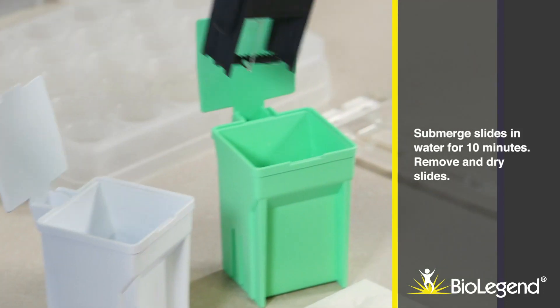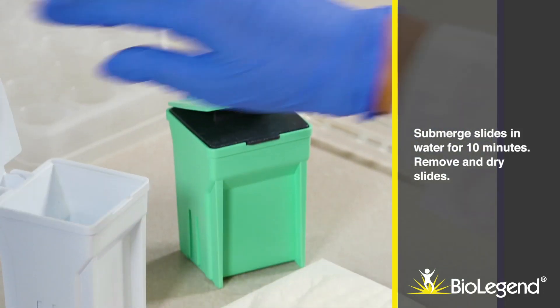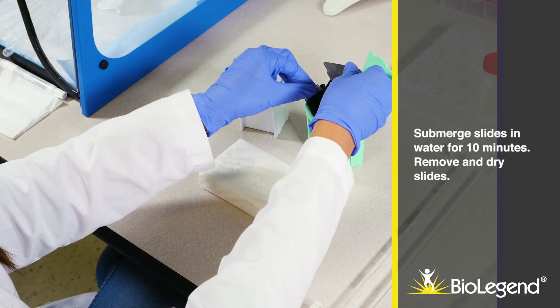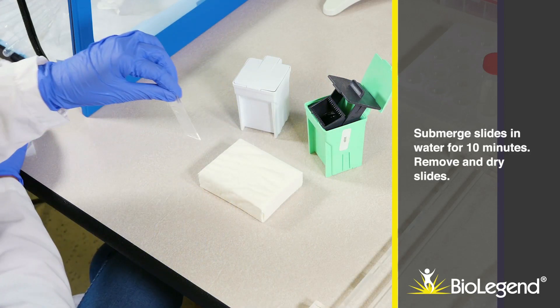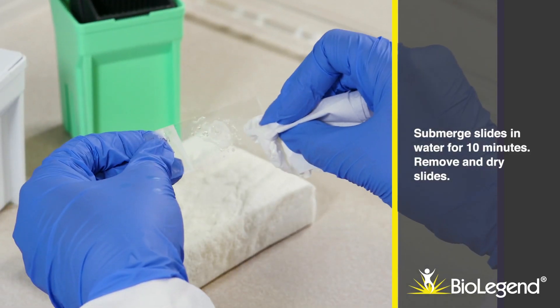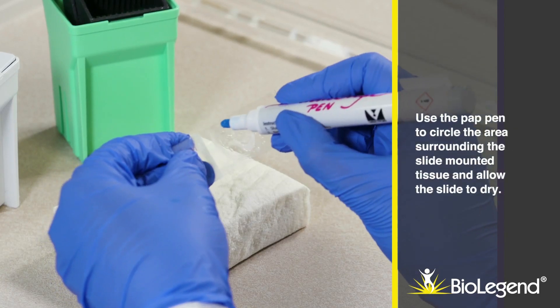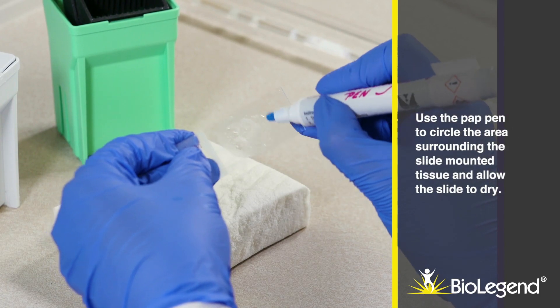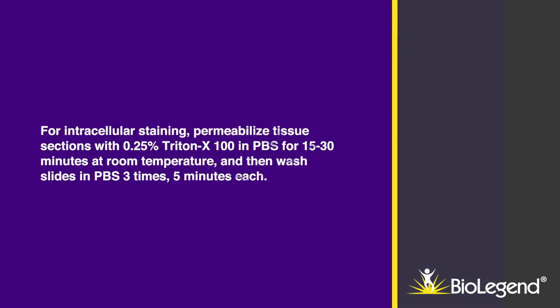Remove and dry slides. Use the pap pen to circle the area surrounding the slide mounted tissue and allow the slide to dry. For intracellular staining, permeabilize tissue sections with 0.25% Triton X-100 in PBS for 15 to 30 minutes at room temperature, and then wash slides in PBS 3 times, 5 minutes each.